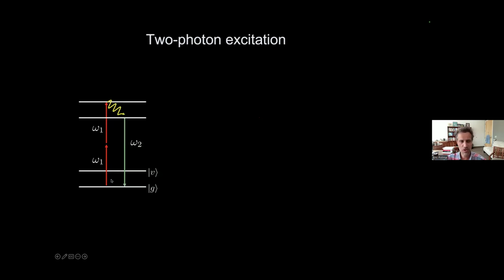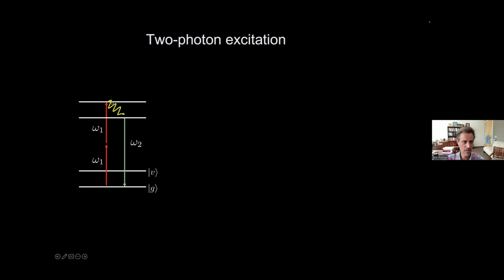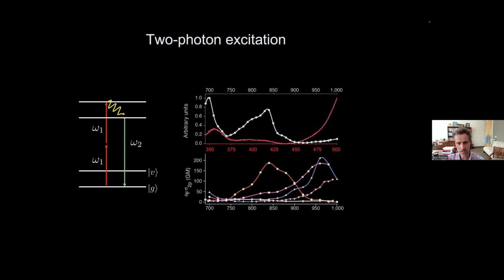Two-photon excitation, of course, I think most of you are familiar with, is very much related to second harmonic generation. But here there's a fat line, which means this is the real state of the molecule that I'm exciting. Now I can park energy in there. Part of that energy will relax and fall back to the lowest emitting state, from which I harvest this particular photon, omega 2, which is a different wavelength. I can simply put a filter there and detect that light. So that's two-photon excited fluorescence.